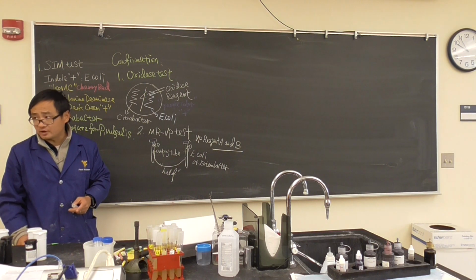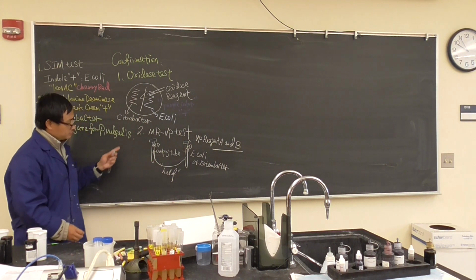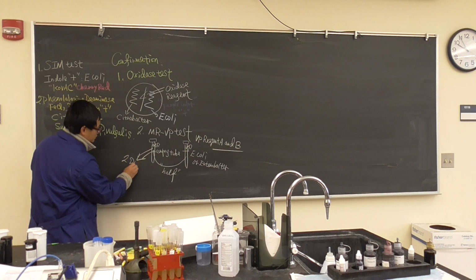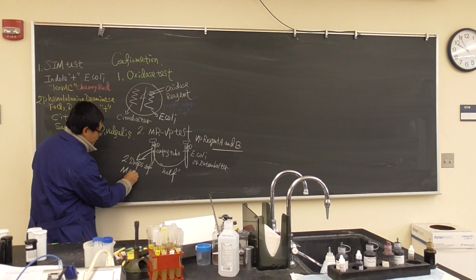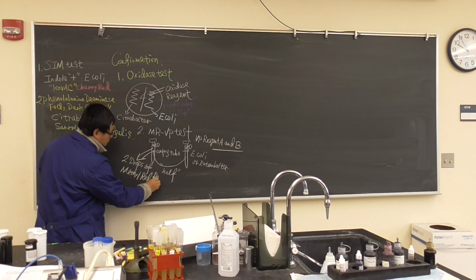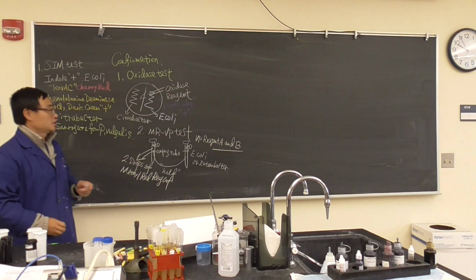That needs to take a couple of hours. Okay, so for methyl red, you just add 2 drops of methyl red reagent and then do the observation immediately.